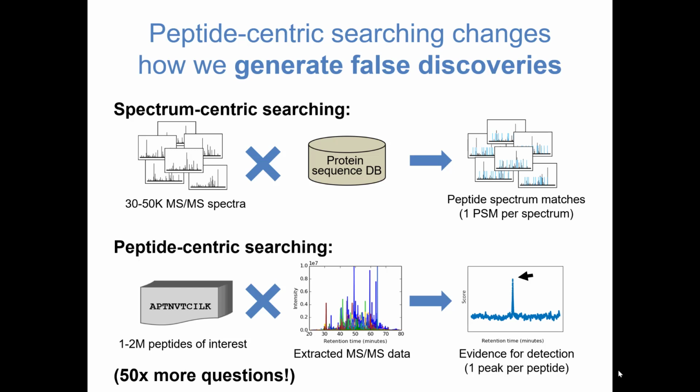Not necessarily, if I wrongly picked the more abundant species. Yes, but it will probably only have a handful of fragment ions associated with it, not lots of fragment ions associated with that peptide. We can look at some of that data afterwards.